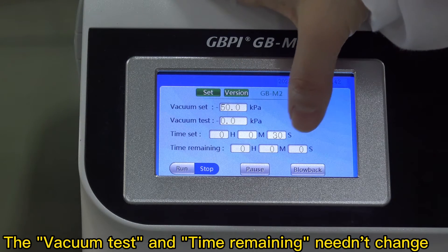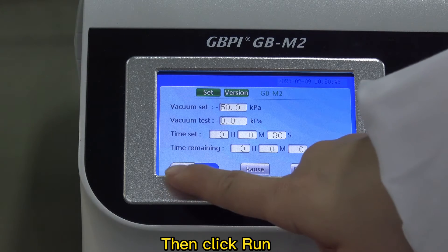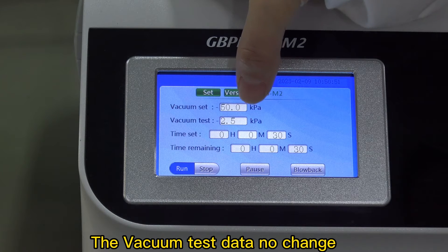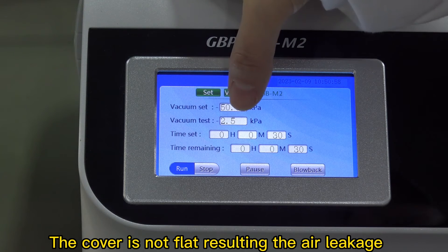Then click run. The vacuum test data shows no change — the cover is not flat, resulting in air leakage.